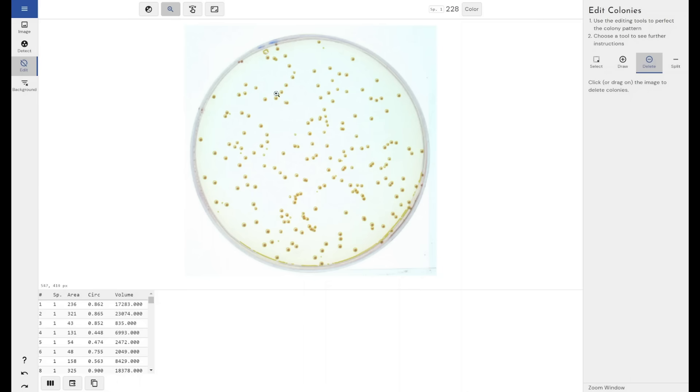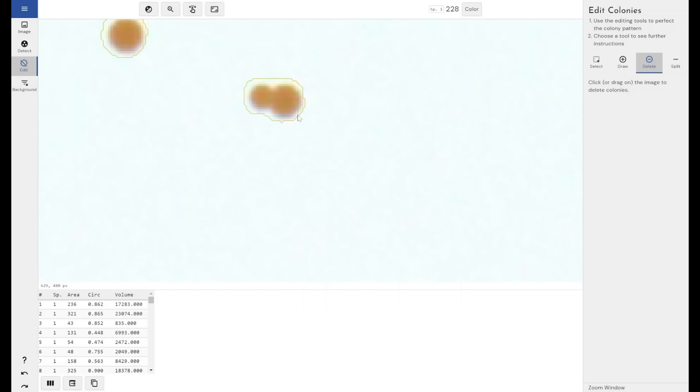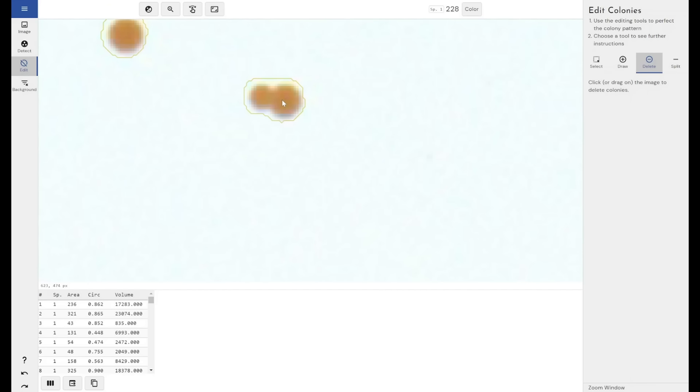You can also manually split colonies. If you see these two colonies here, the software has detected them as one large colony because they overlap in the middle here. There's no distinct line that separates these two circles in terms of the image. So the software can't automatically define this as one circle and two circles.